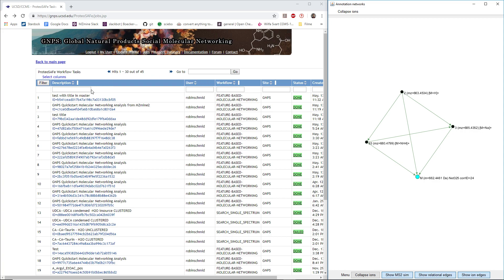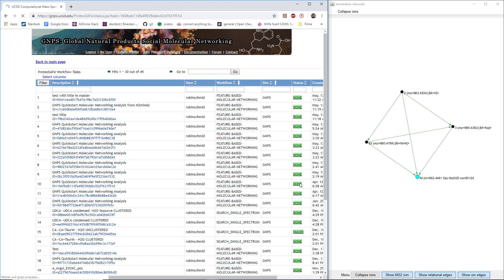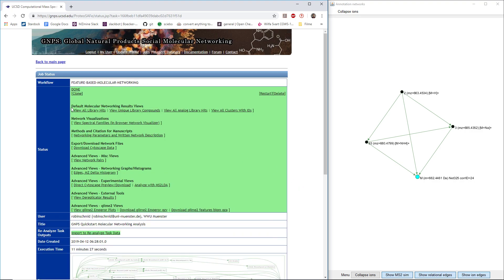So we did this, and we have all the jobs here. If we log into GNPS, we can just go on Jobs, and then we see all the jobs that we ran lately with feature-based molecular networking. We can click on the Done button, and we can see all the results that we can view in the GNPS web browser, or download. For this workflow, we need to download the Cytoscape data.